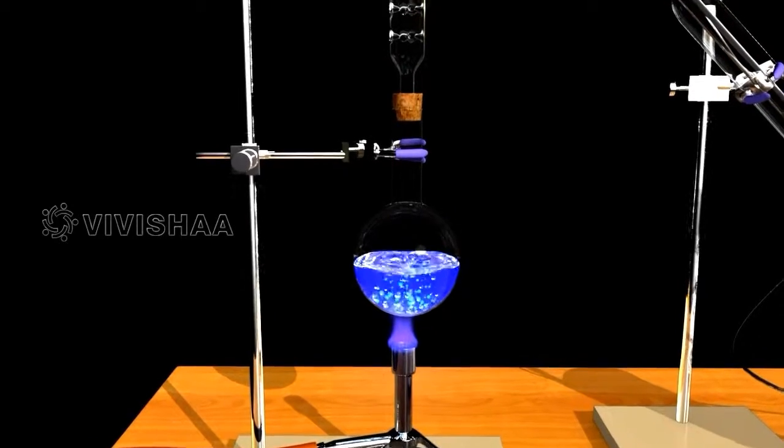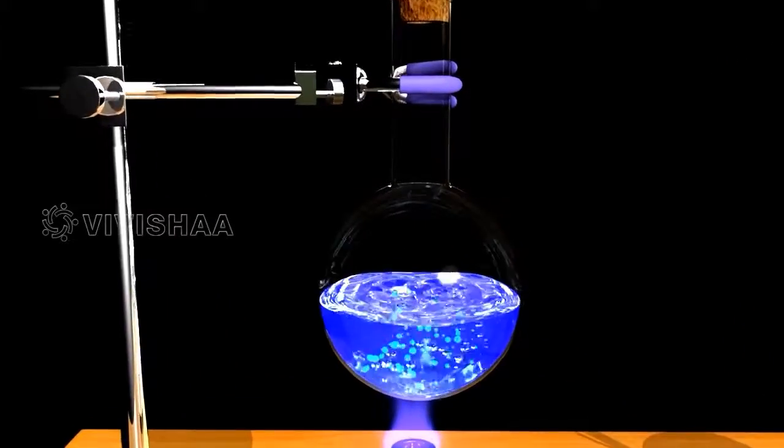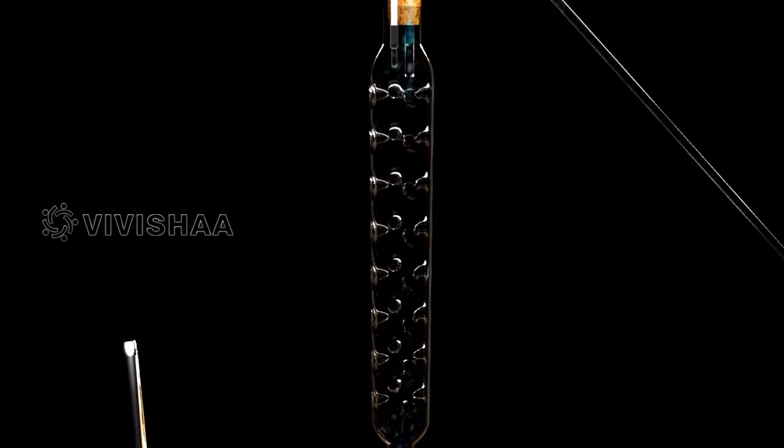A fractional distillation unit consists of a round-bottomed distillation flask and a fractioning column packed with glass beads. The glass beads provide extra surface for vapors to cool and condense continuously.